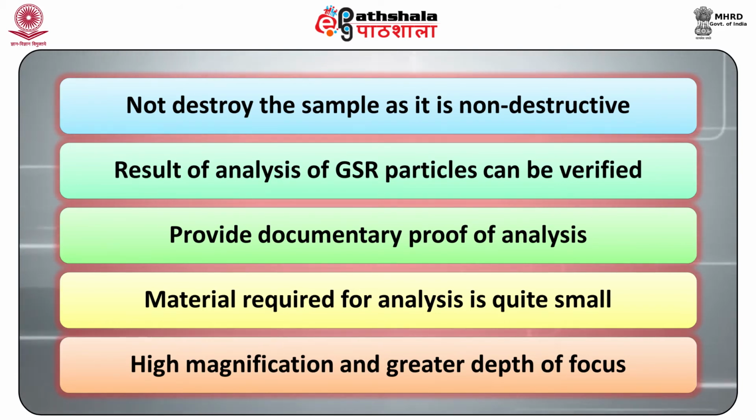Number one, it does not destroy the sample as it is non destructive. Number two, the result of analysis of GSR particles can be verified if required at any time. Number three, it can provide documentary proof of analysis. Number four, the material required for analysis is quite small. Number five, and the last one, SEM has a very high magnification, better resolving power, and greater depth of focus.